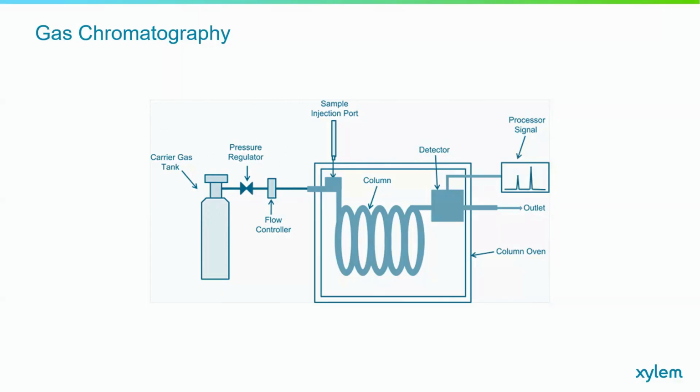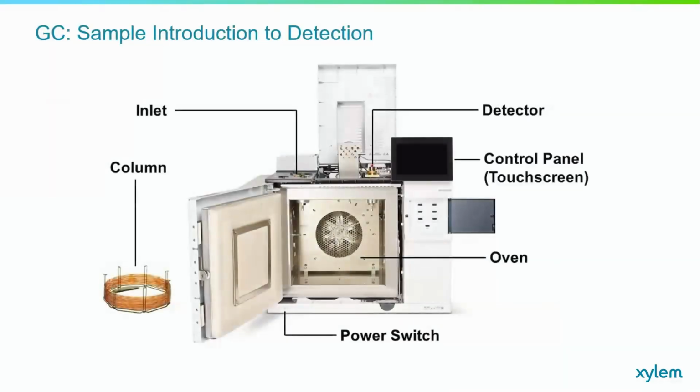In order for GC to work, the compounds must be vaporized without completely breaking down during sample introduction. Most often the carrier gas is helium, hydrogen, or nitrogen. So we're moving compounds through a column and onto a detector. In the next slide, I'll discuss what happens inside the column and give you an overview of everything GC.